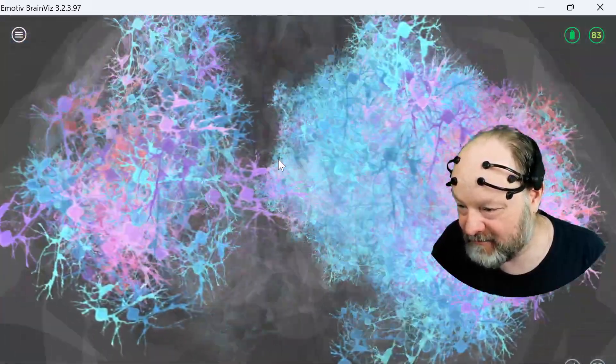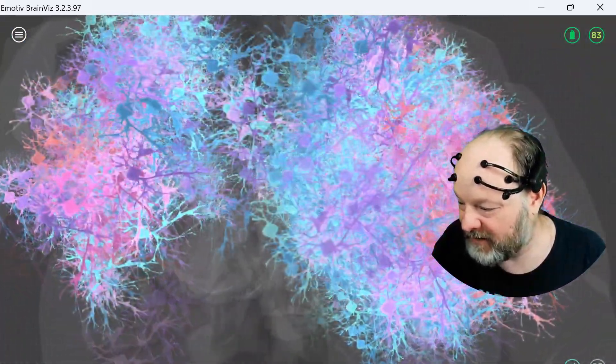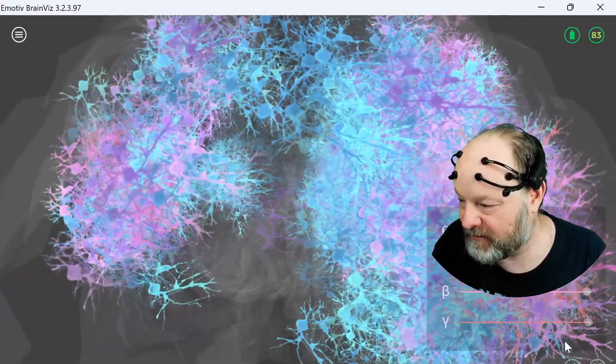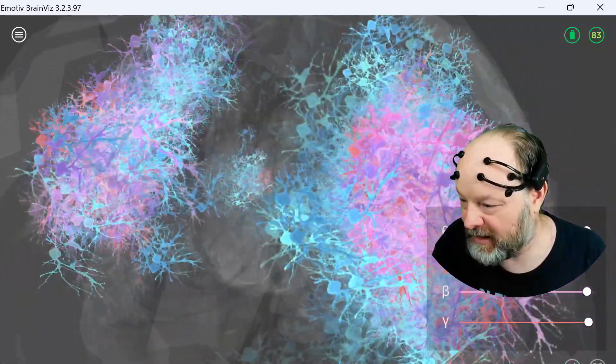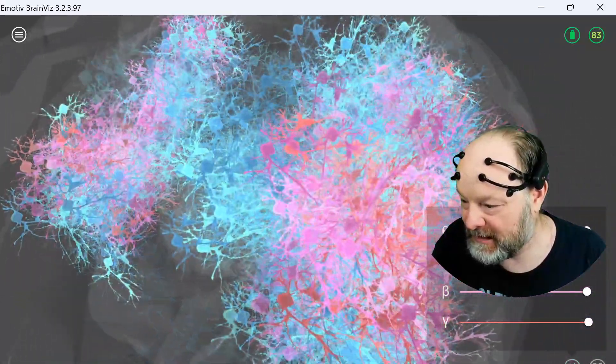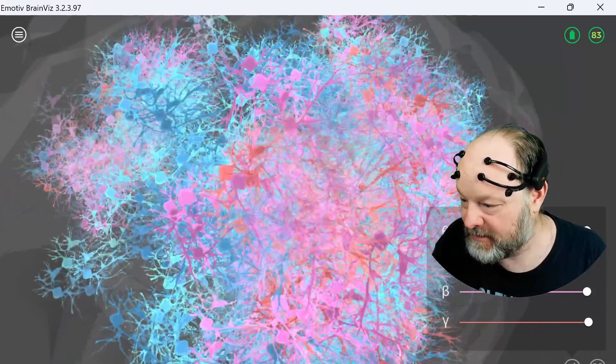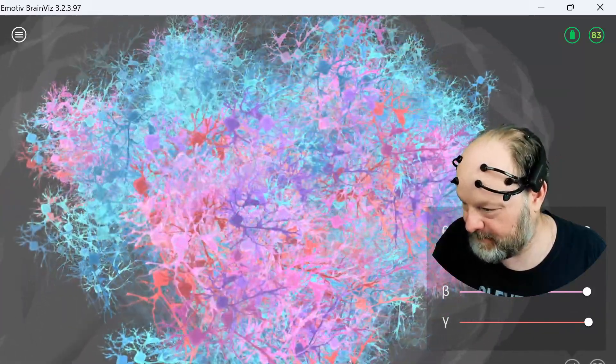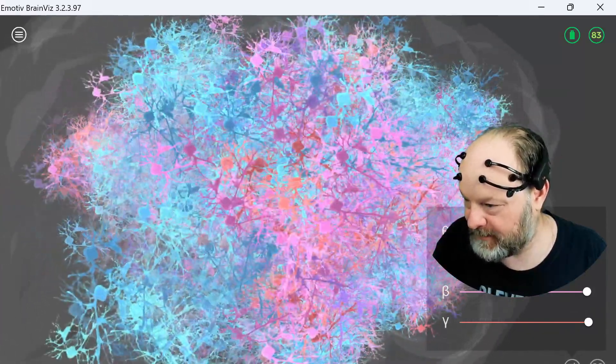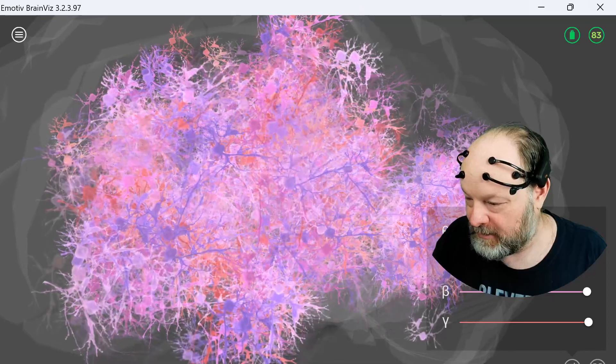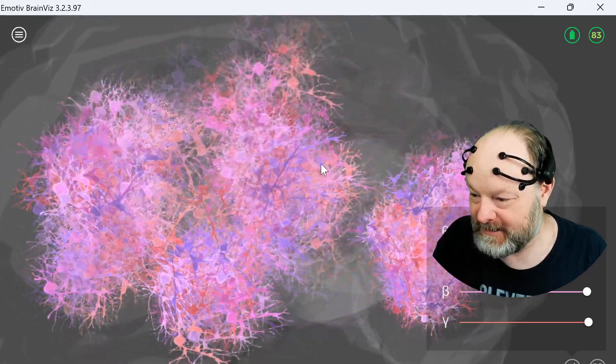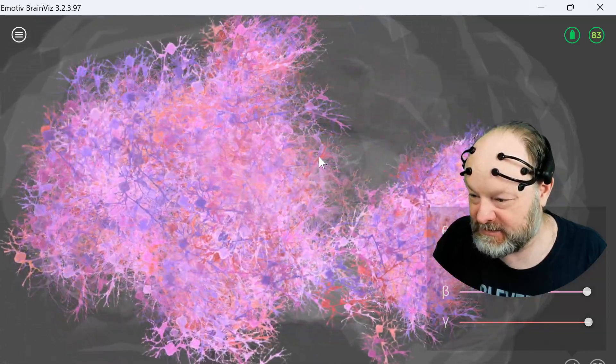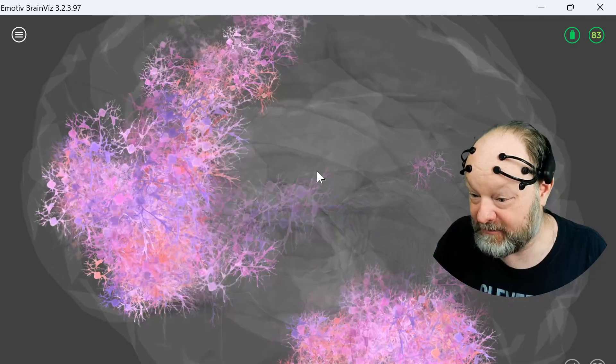So I can change what wavelengths it's tuned to by coming here and adjusting these sliders down or back up. Let's see, blue - I can turn blue down, there we go. So I can turn that down to see different parts of the brain that are active or different wavelengths.